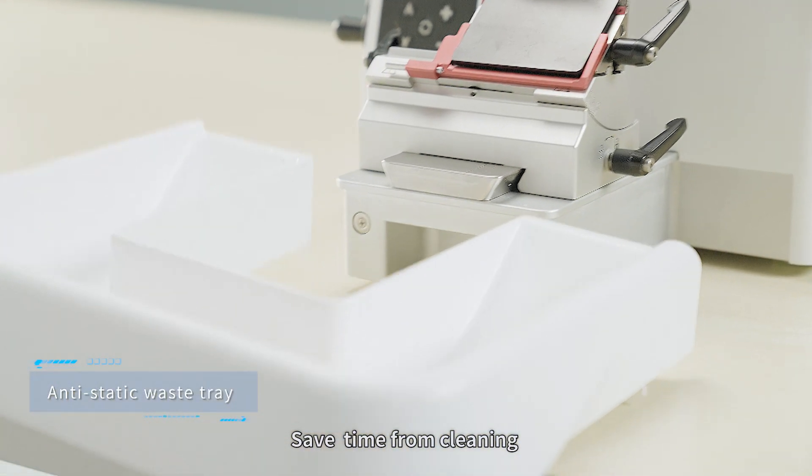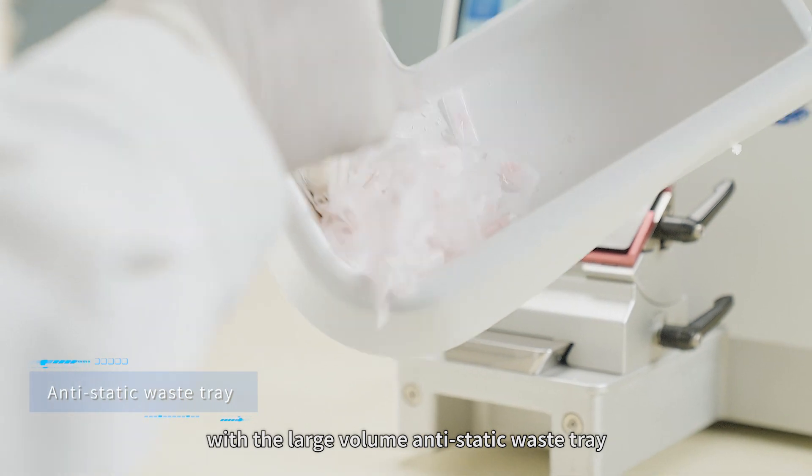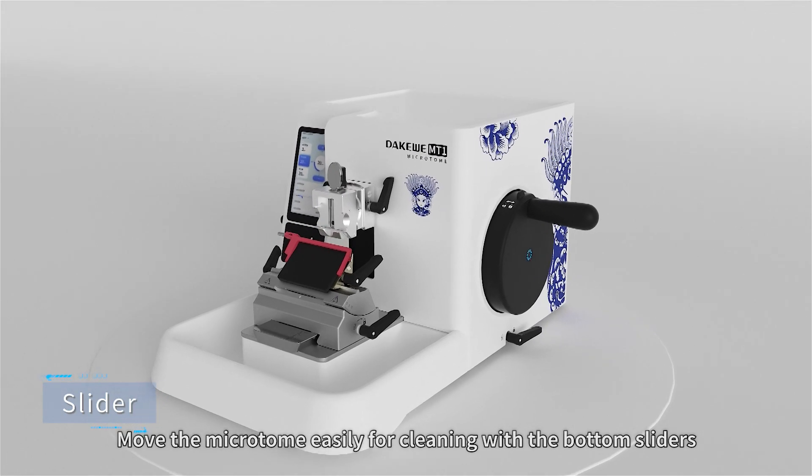Save time from cleaning with a large volume anti-static waste tray. Move the microtome easily for cleaning with the bottom sliders.